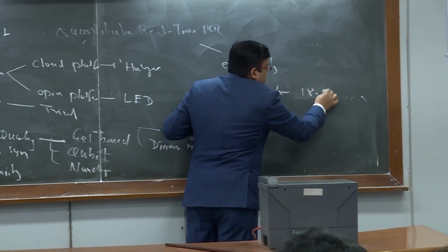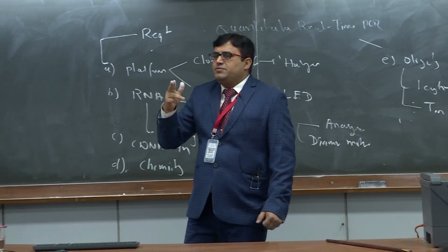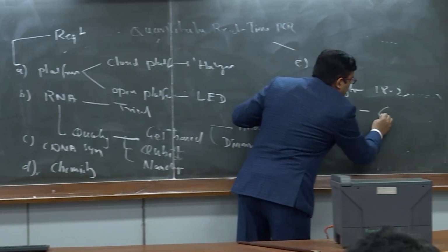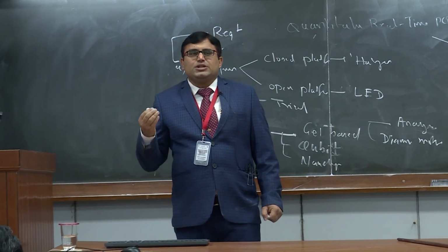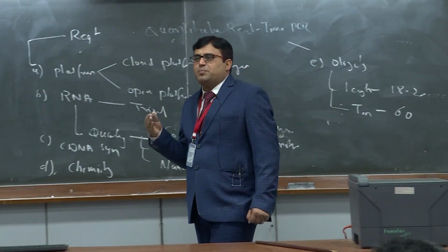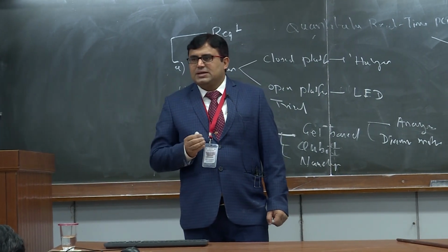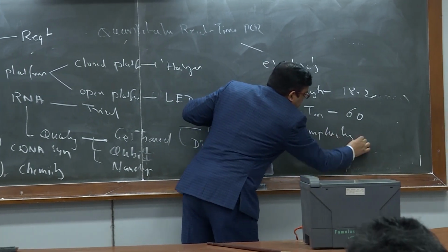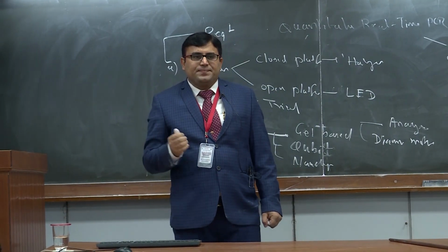Then when you talk of the Tm, most of the time we prefer that the Tm you select should be 60. Then your primer should not self-anneal. It should not have the same base more than twice at the starting or the end point. It should not be 3 or something like that. There should not be complementarity between the forward and the reverse primer. It should not form a dimer.